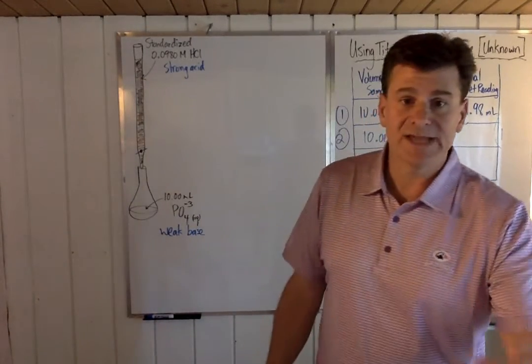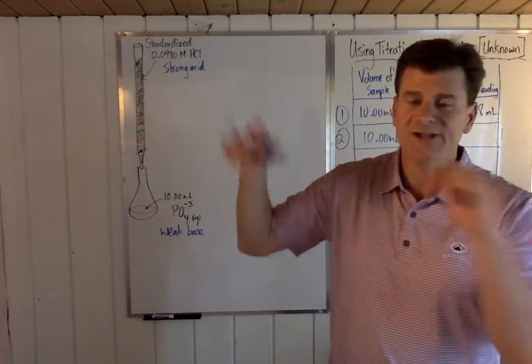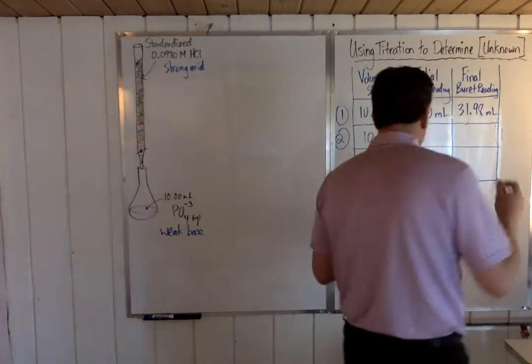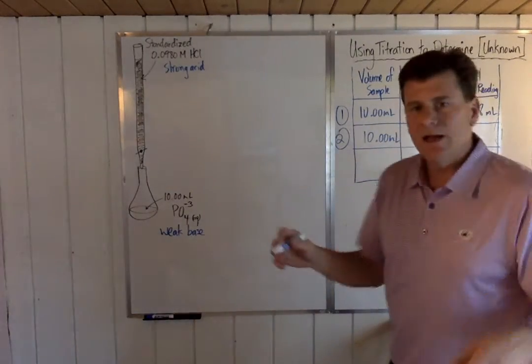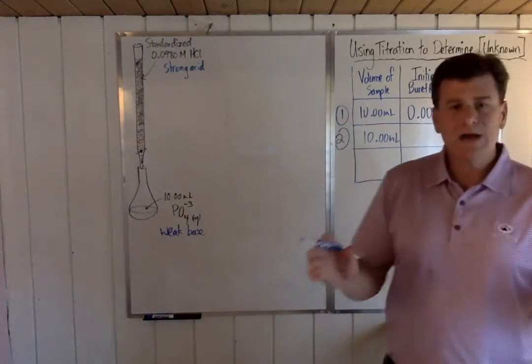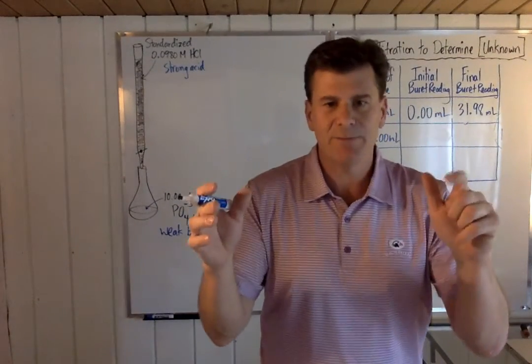And of course, you have to do a second trial to confirm the first trial. And so you refill, and you don't go to zero the second time. You get a little bit lazy. But before I actually do that, let's go through one of the mistakes people make.